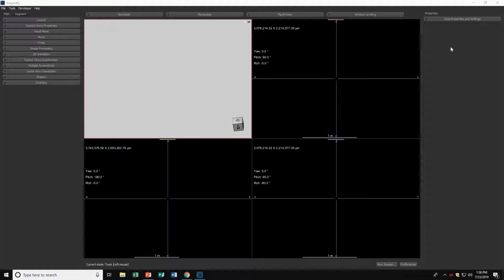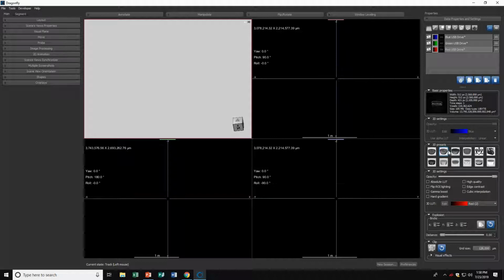The toolbar for data properties is in the top right hand corner. When you click it, everything will come up. At the top, there is a filter panel which contains all of the filters that organizes each object by their category. So our first filter is for data sets.